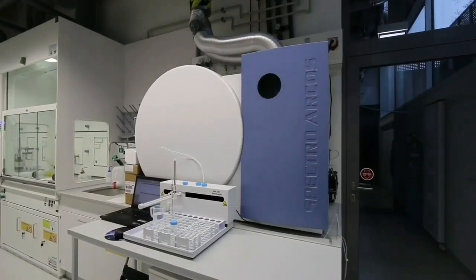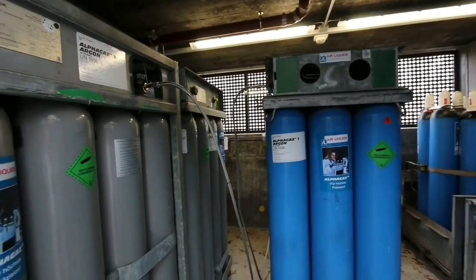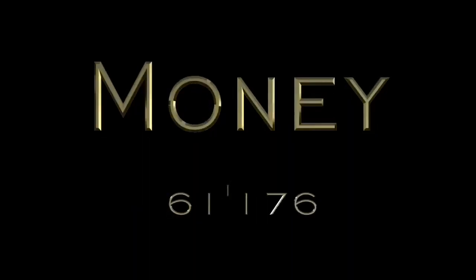Operating ICP-OES is not easy and is costly. We need high voltage, argon flow, sophisticated ventilation, plenty of space, a skillful technician, and of course, a lot of money.